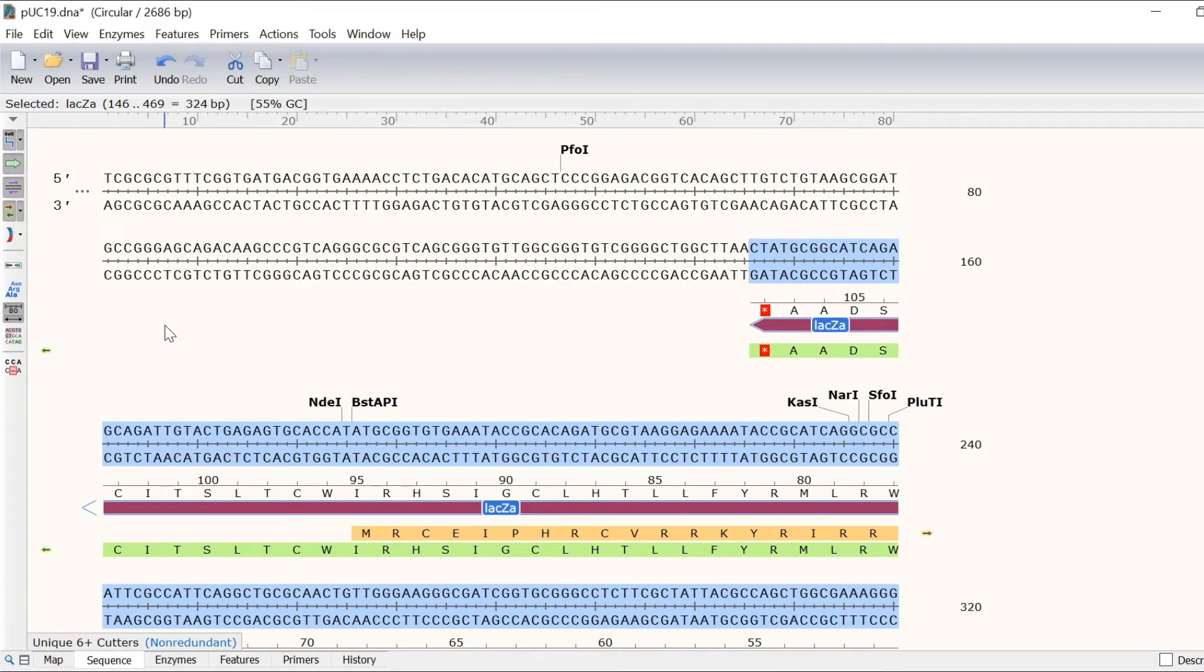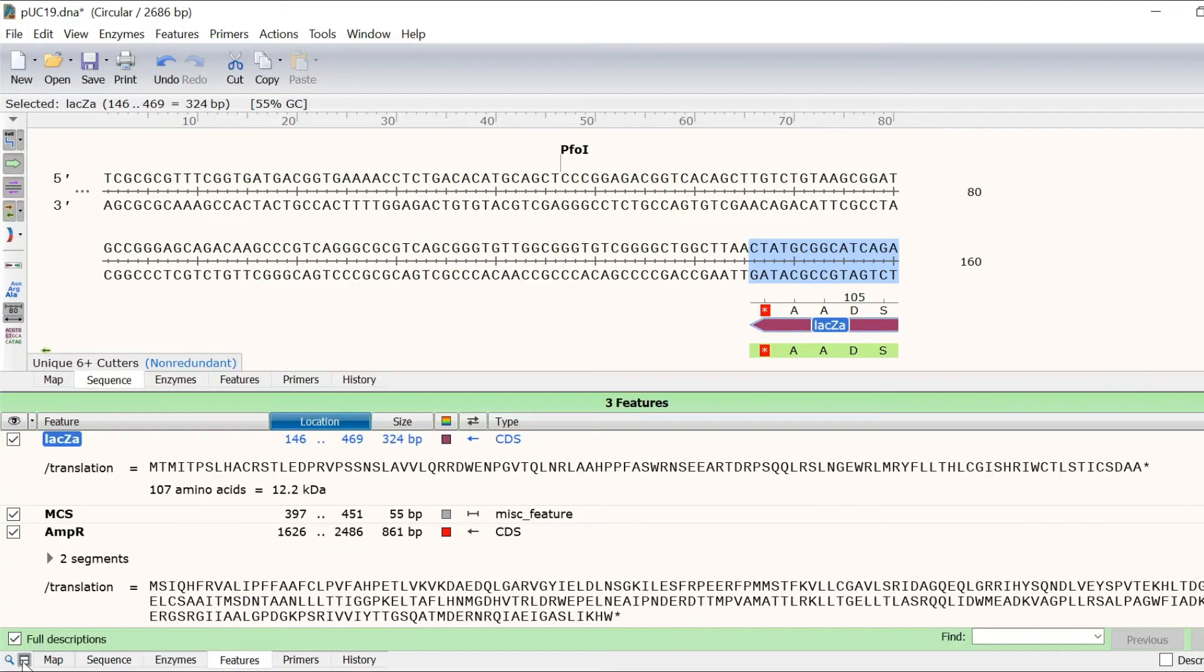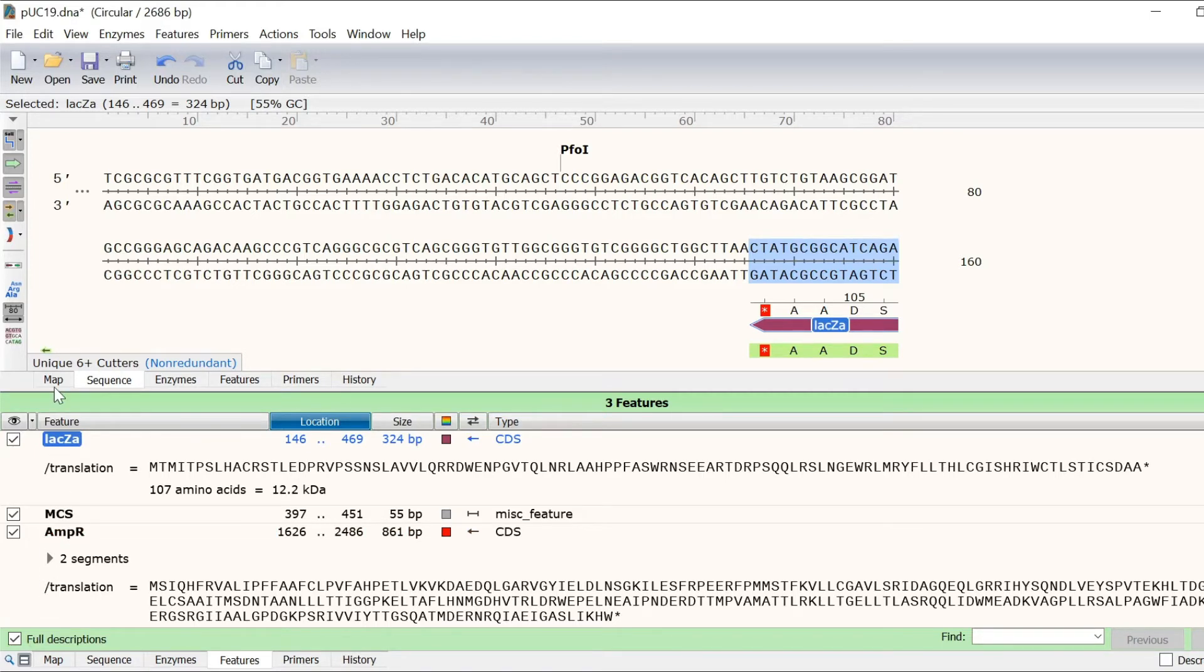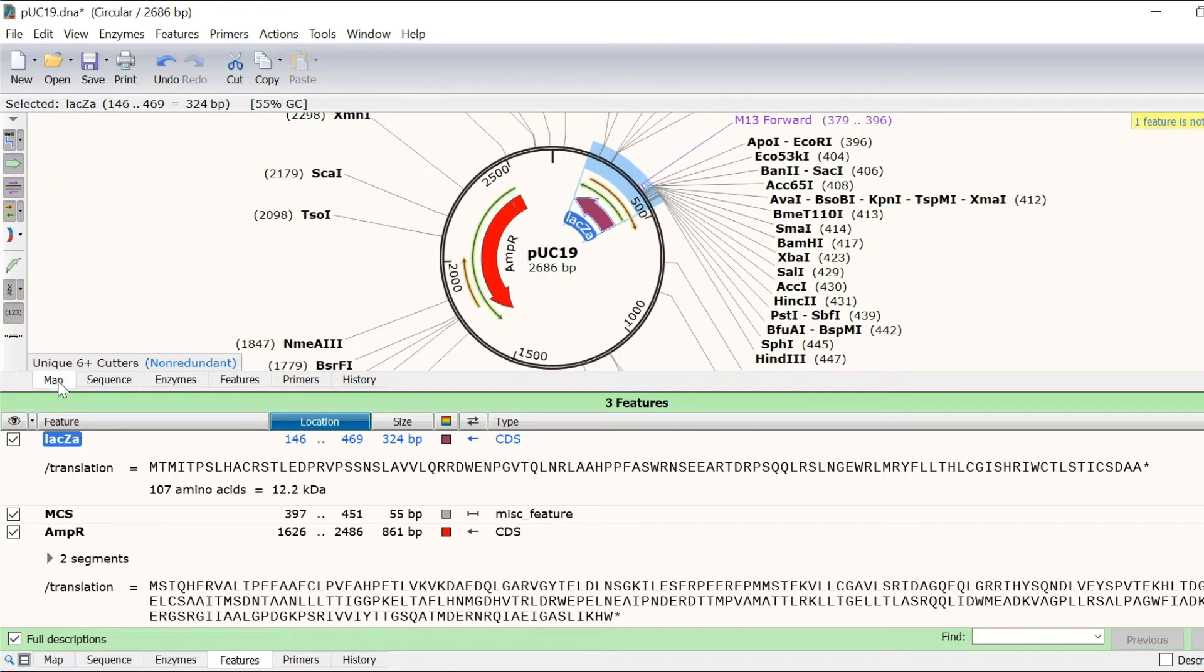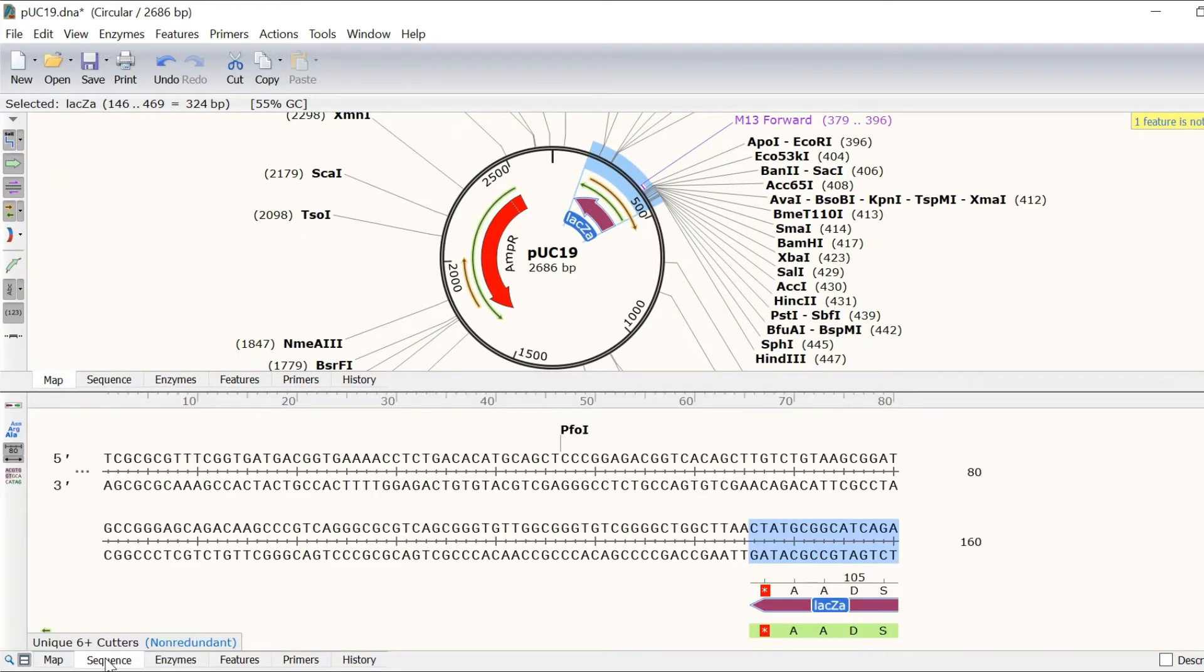The split window button at the bottom enables you to split the Snapgene window into two. This is useful when you want to view two different tabs at the same time. For example, you can view the map view and cross check the DNA sequence with sequence view, all within the same screen without the need to switch tabs.